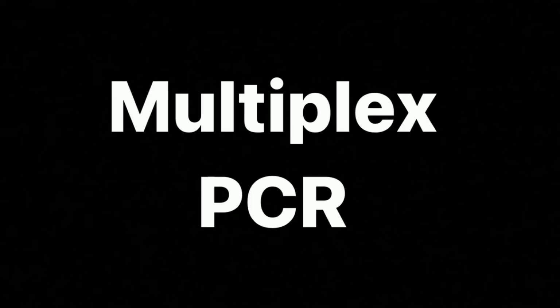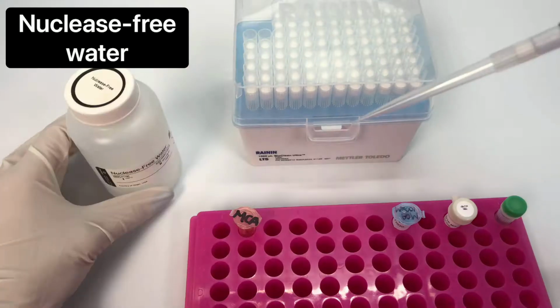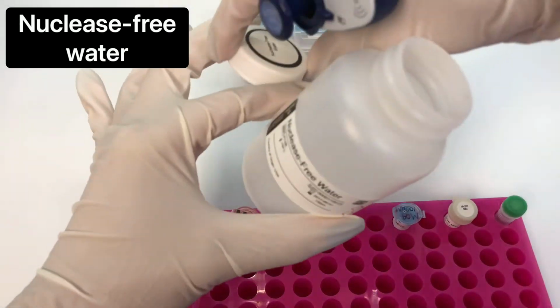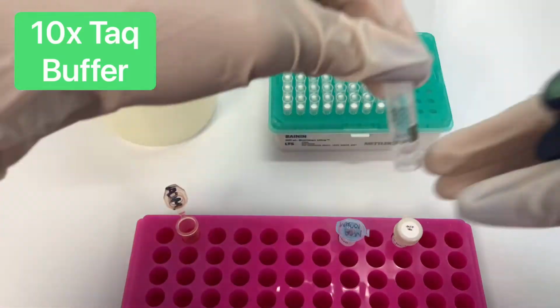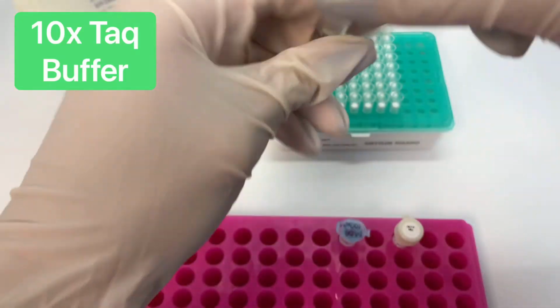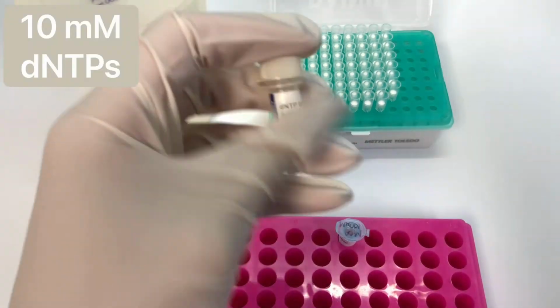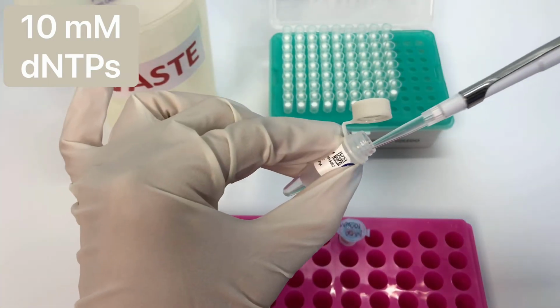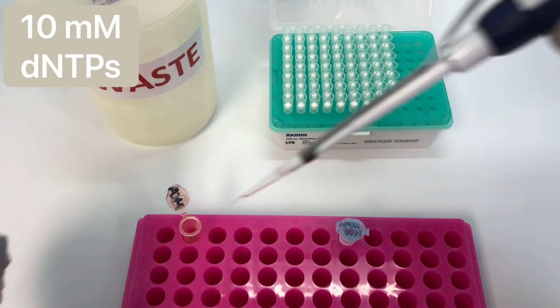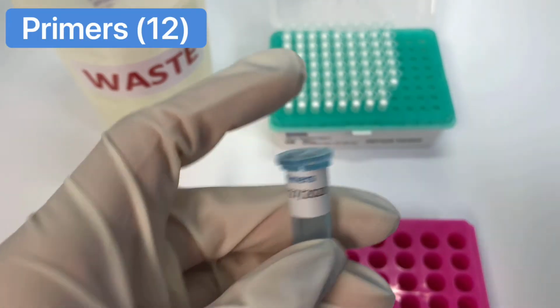Now we are ready to proceed to PCR. This will be the master mix protocol for our PCR. Start out by adding nuclease-free water. Next, add the 10x Taq buffer. Then we are going to add the 10 millimolar dNTPs. Next, we are going to add the primers.